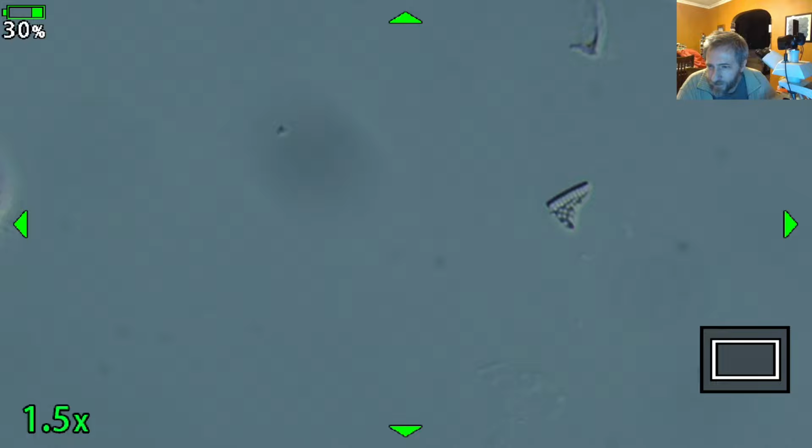If you have diatoms in your tank, I sometimes will take them. We had some diatoms growing in the fish tank here, and I took them in and processed them and mounted them. I think I have them in a semi-liquid form, which is what they look like when we're done digesting. It's mostly water, and then there's a bunch of stuff at the bottom. The stuff at the bottom is actually diatoms. There's enough of them there that you could actually see them. They look like a gray or white color.